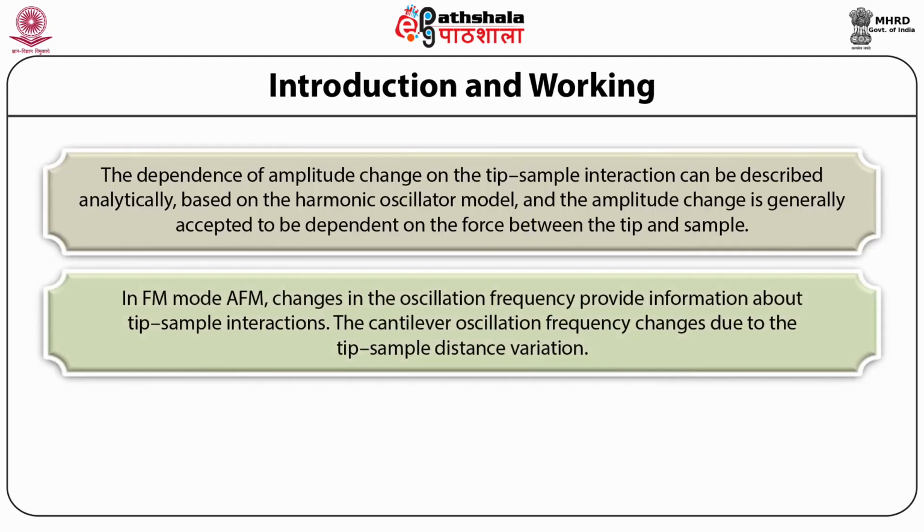In FM mode AFM, changes in the oscillation frequency provide information about the tip sample interactions. The cantilever oscillation frequency changes due to the tip sample distance variation. A feedback system regulates the frequency change to keep the set point frequency constant, allowing the topography of the sample surface to be acquired.